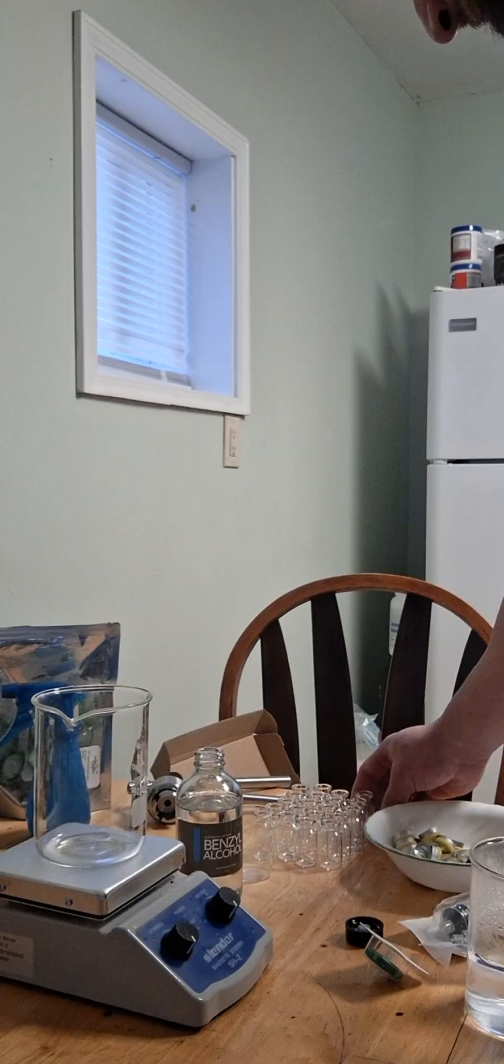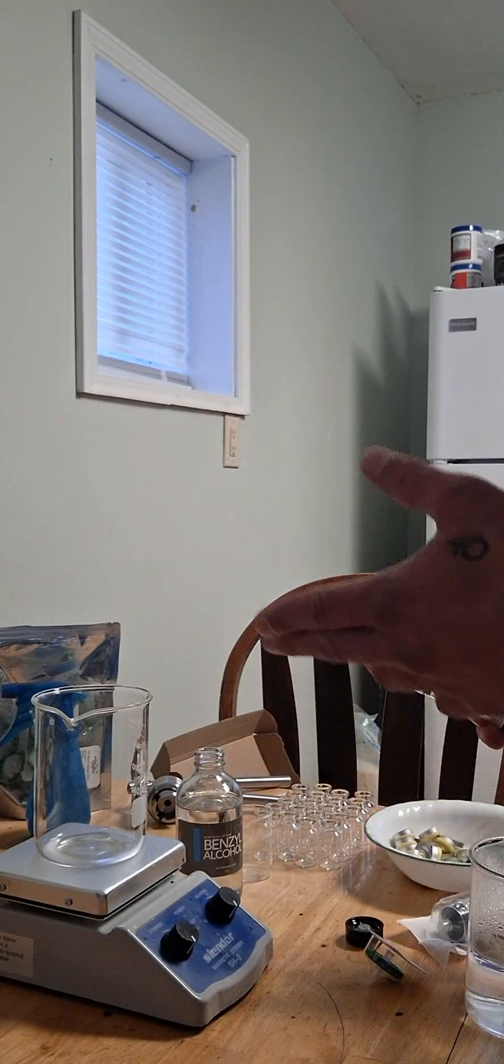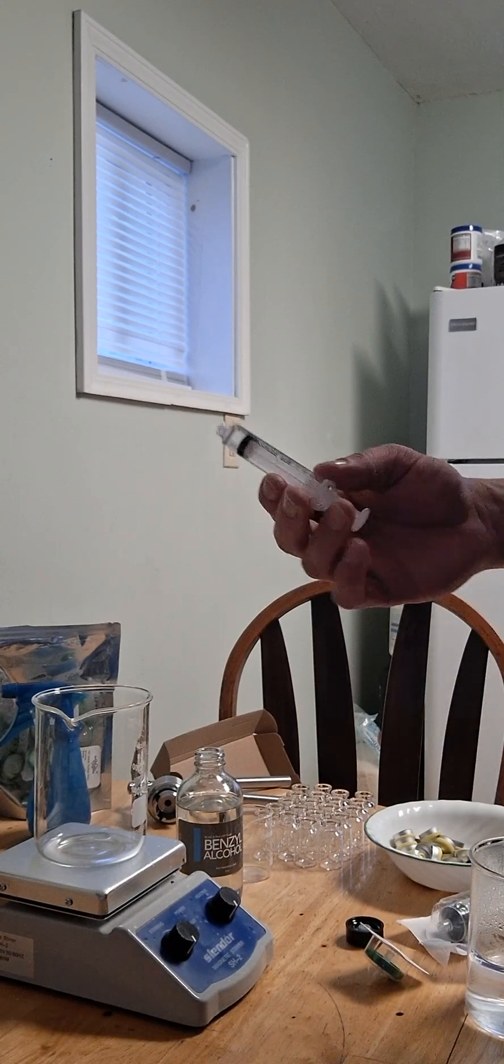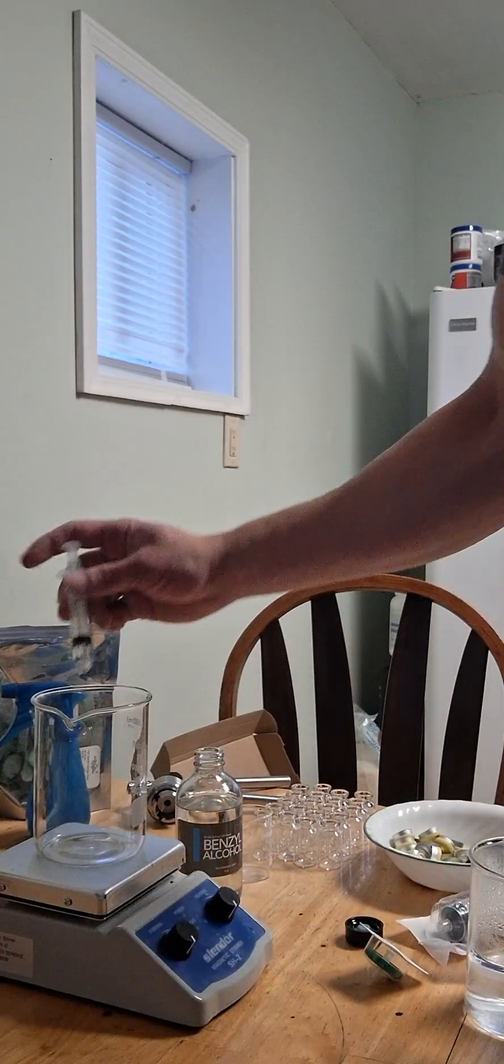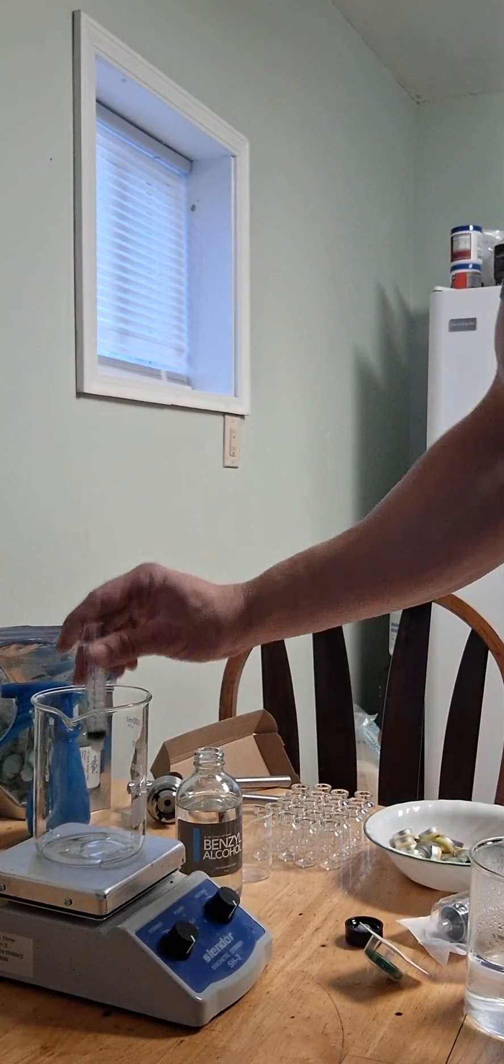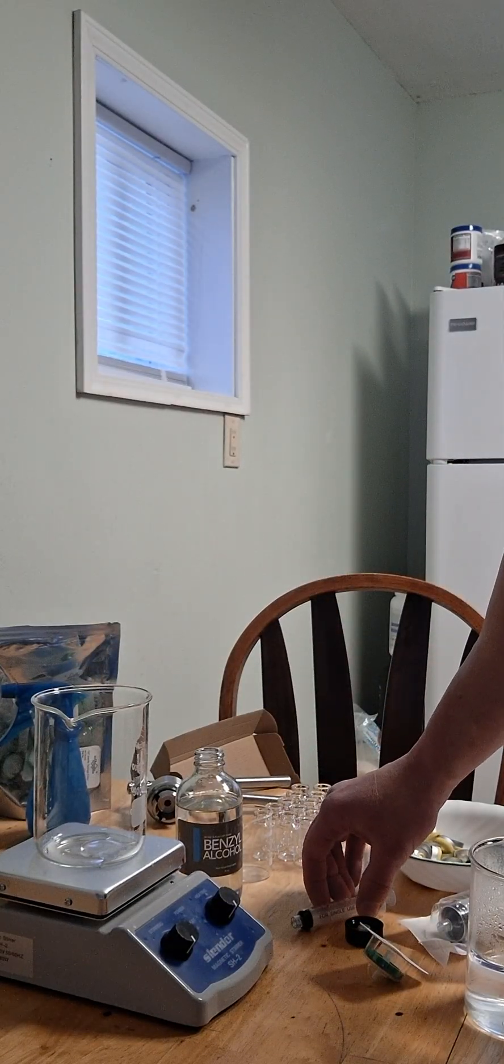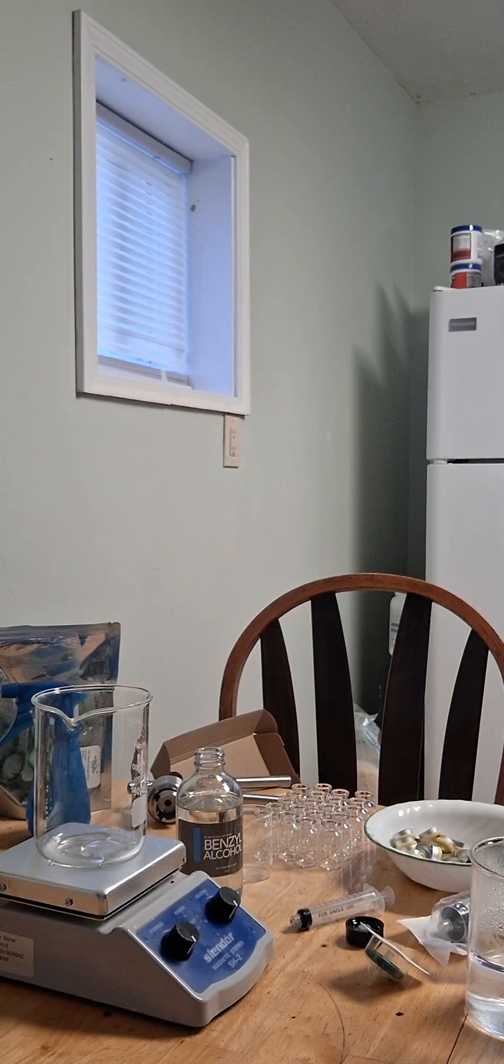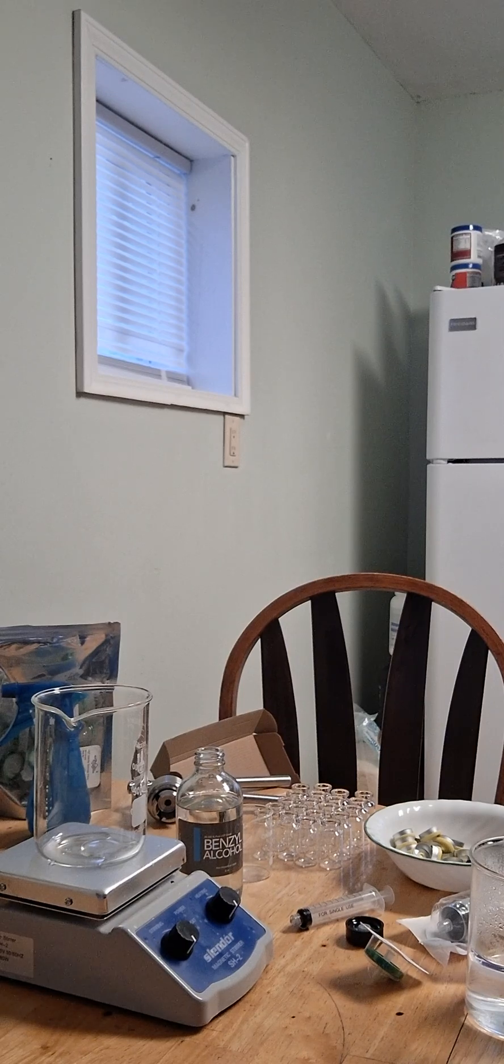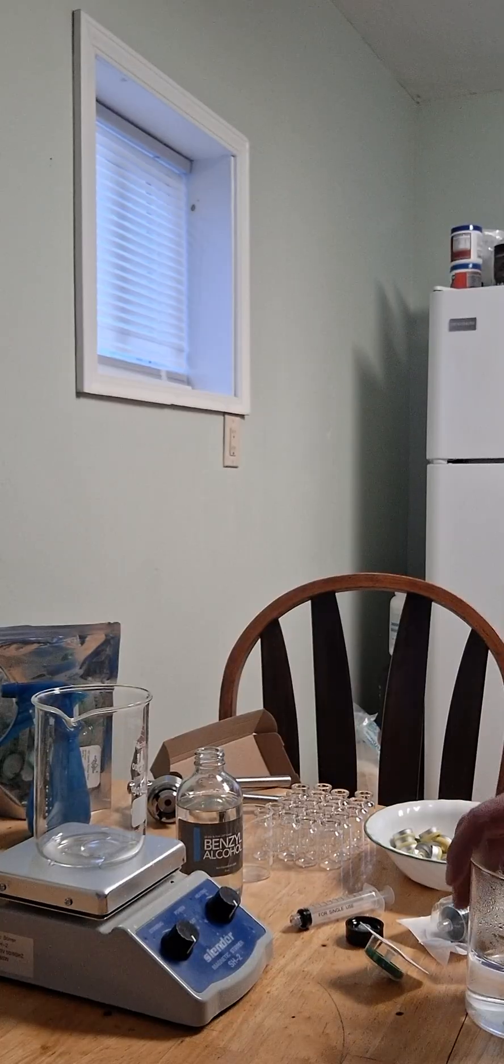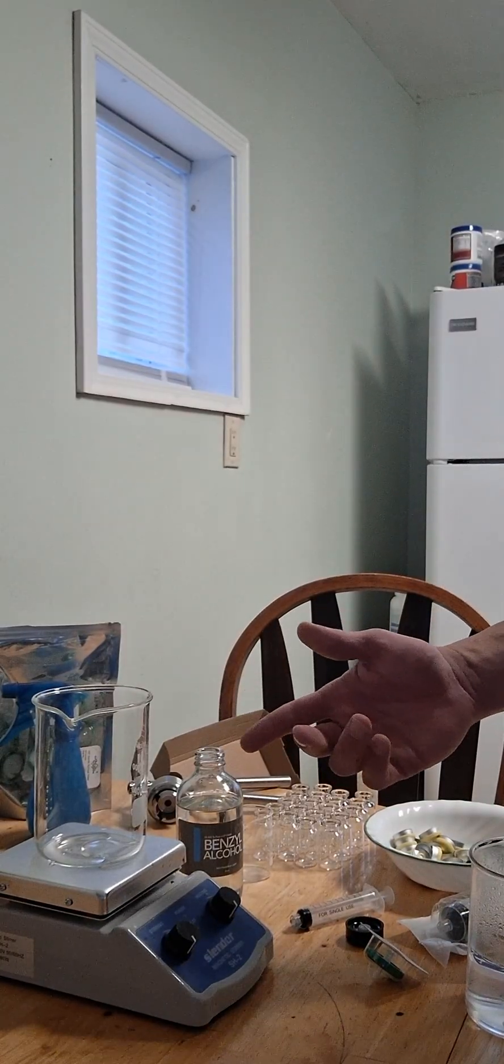Okay, I'm going to be making 200 milliliters of the water, so I would be using two milliliters of benzyl alcohol. I'm going to add that first. The ratio that you want for BAC water is for every hundred milliliters of water you want one milliliter of benzyl alcohol, and that would give you a 0.9 percent benzyl alcohol concentration.